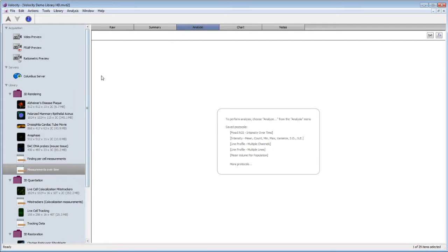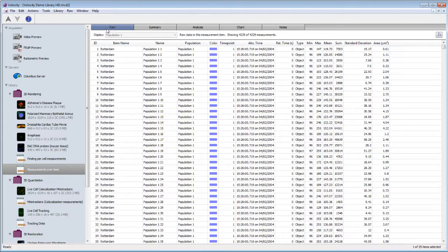In the second example, shown here, we have time-resolved data where the intensity indicates changing activity over time, and we want to know by how much. The absolute numbers alone do not provide much insight. Instead, the normal approach is to normalise the data, and that too is possible with Volocity. Here, all the time points have been measured and are included in the measurement item.